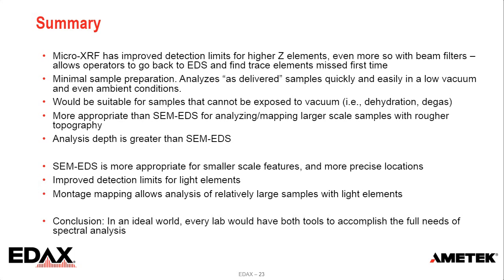Next question, does the SEM magnification change the spot size in EDS? It does not. The spot size in EDS, or the interaction volume of the EDS, is determined by the accelerating voltage.